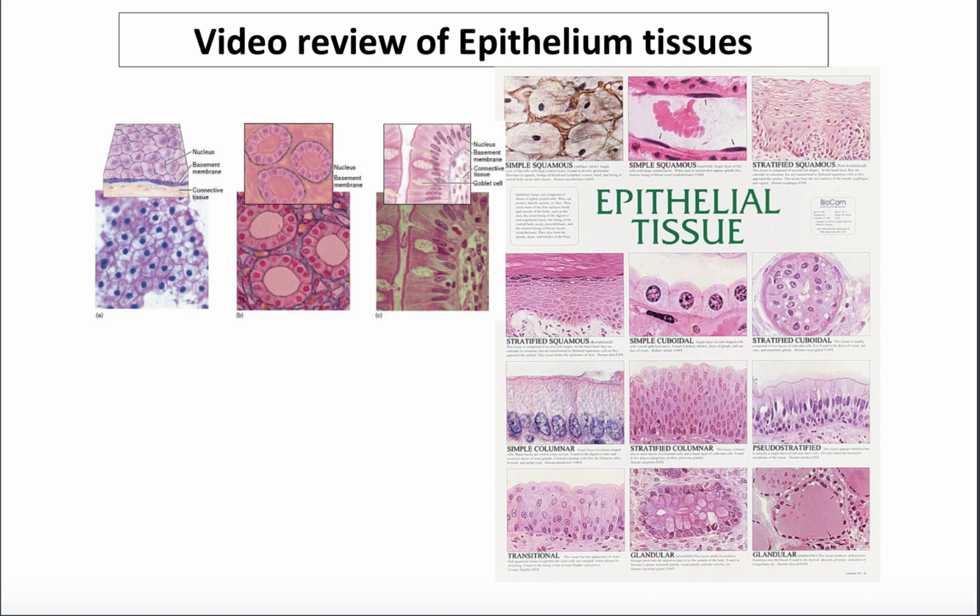This is not a formal note lecture, but this will go over comprehensively different microscope images of epithelial tissues and what you should expect them to look like. And we're going to go over the main common types that were briefly mentioned at the end of the epithelial note lecture, which is stratified squamous, simple cuboidal, simple columnar, simple squamous, pseudostratified columnar, transitional, and stratified squamous.